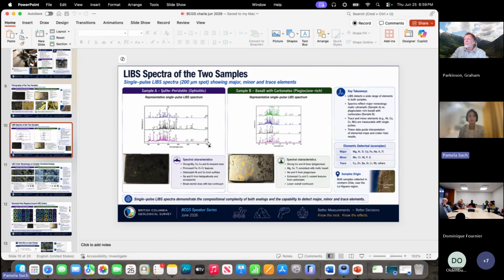The other problem is when these companies are running LIBS and mapping LIBS over core samples, as I just showed you, LIBS evaporates the sample and recrystallizes it. That's okay, because when you shoot LIBS, the data at that very moment is the exact data of the sample. But then you probably have to polish the sample again, at least 2 millimeters, to clean all that affected area and then go again.